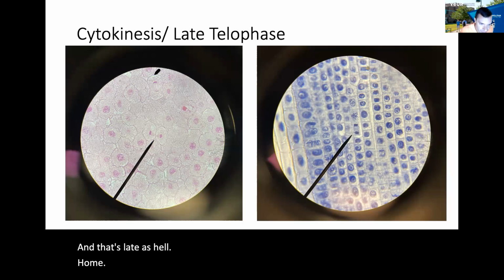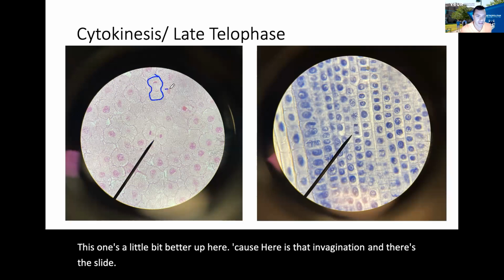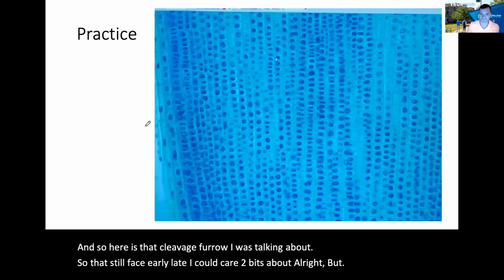This one's a little bit better up here because here's that invagination and there's the slide. Here is that cleavage furrow that I was talking about. So that's telophase. Early, late, I couldn't care less. But that's what you should be looking for.